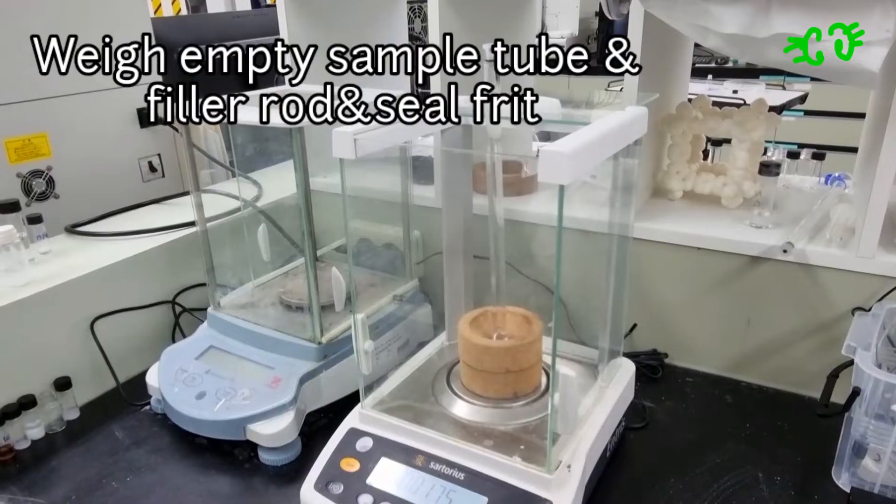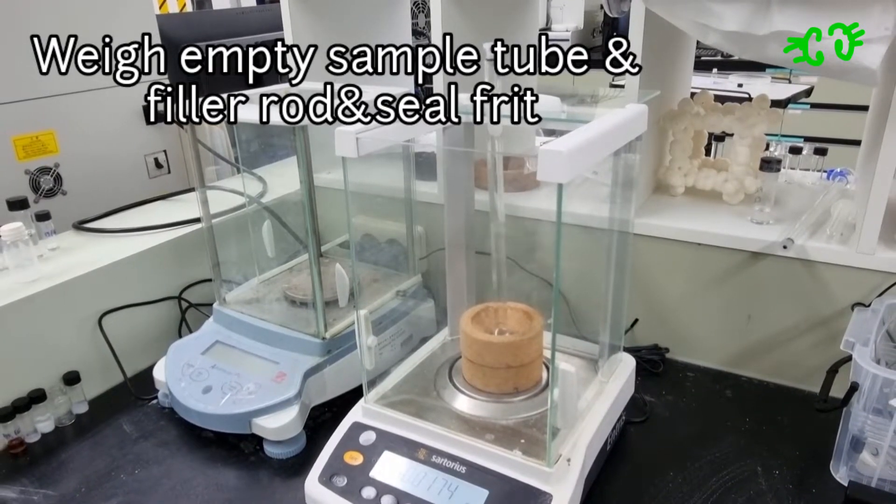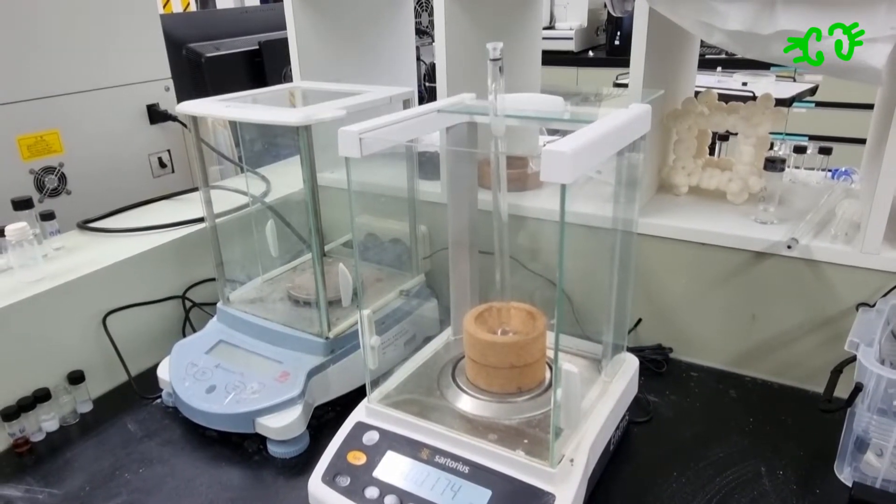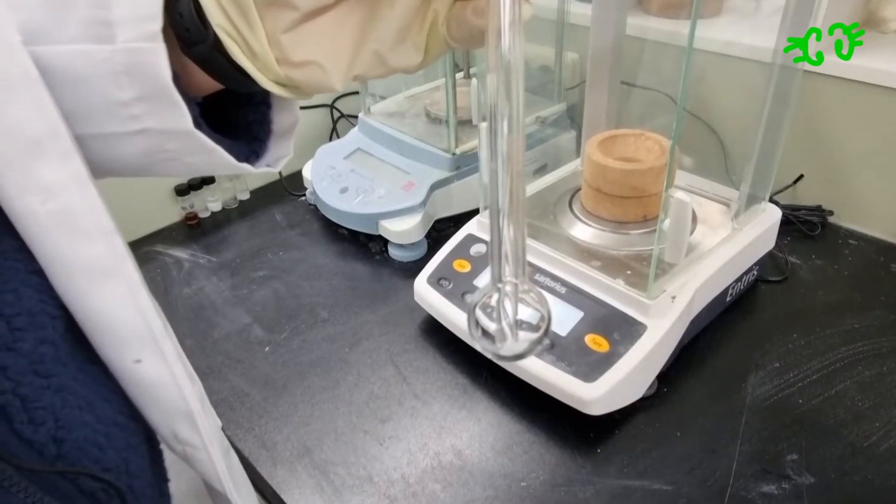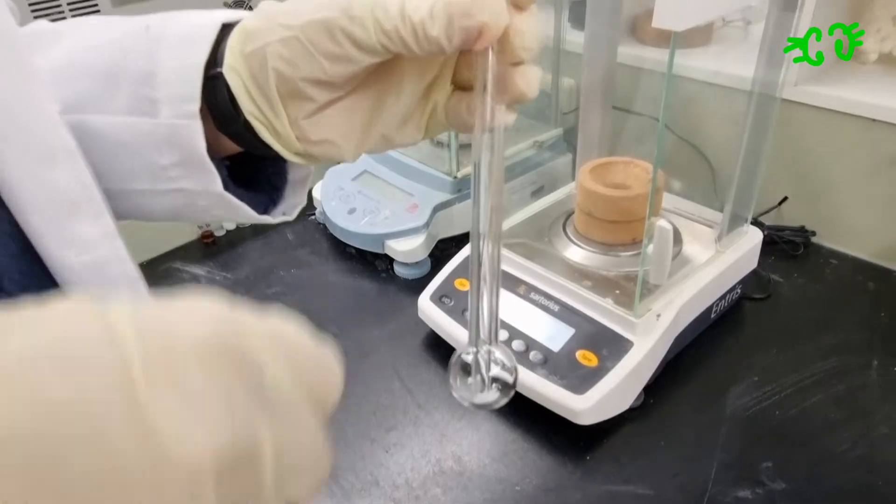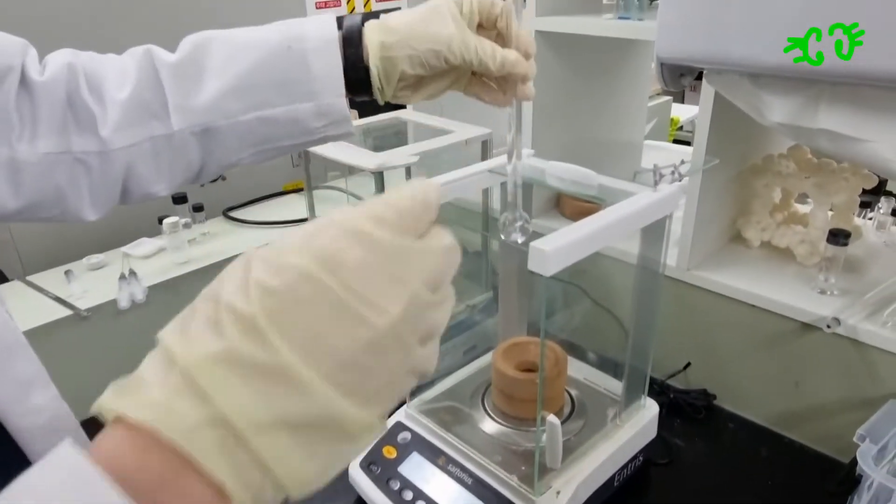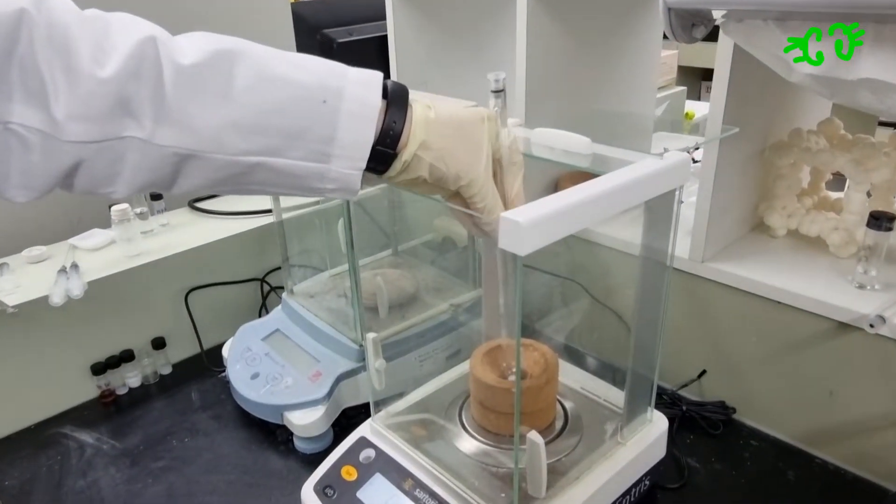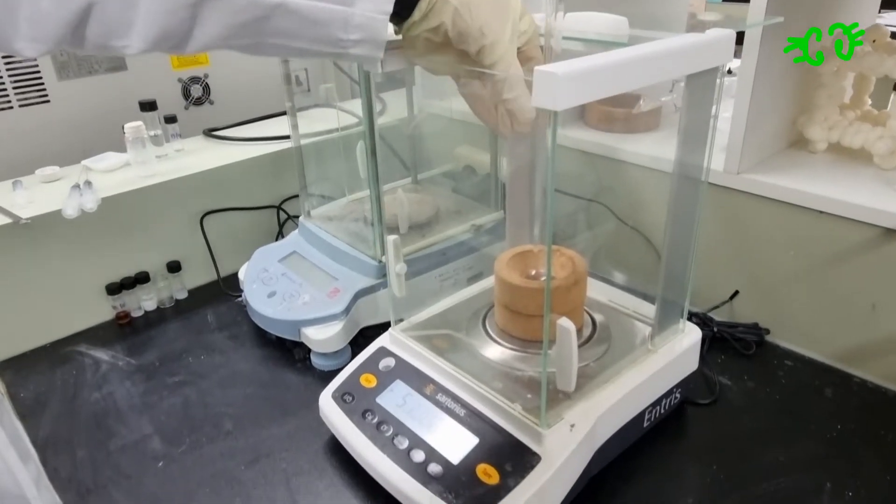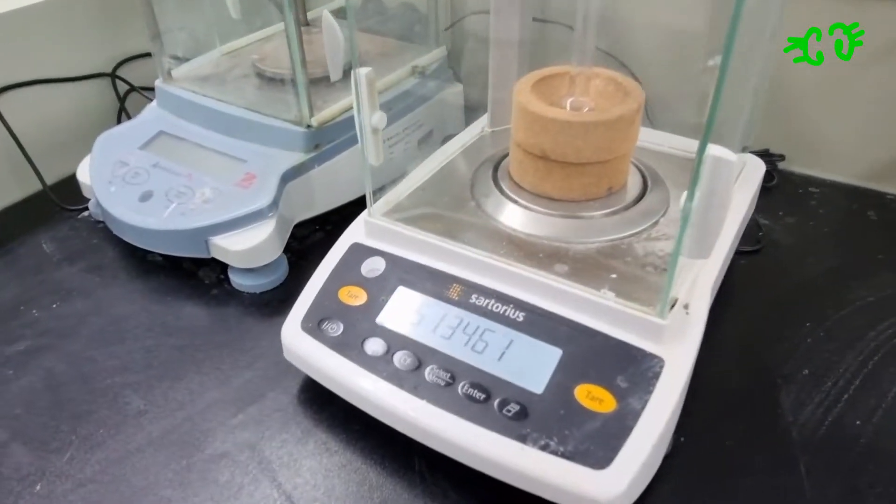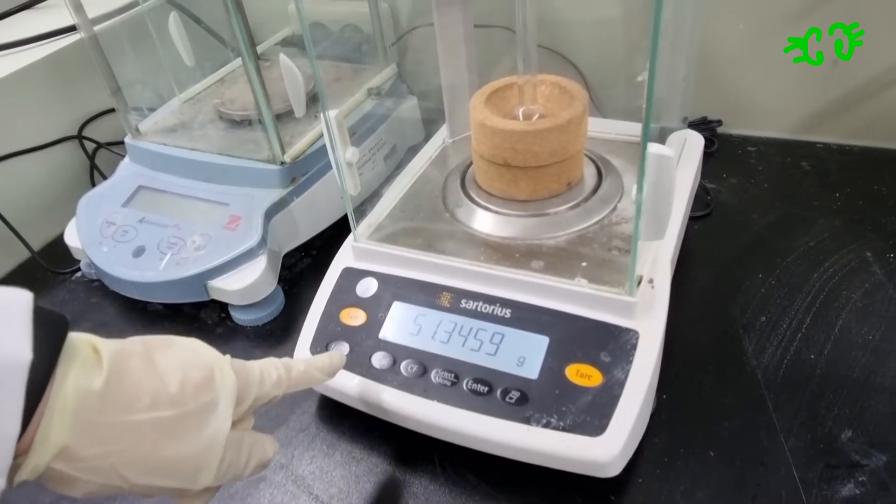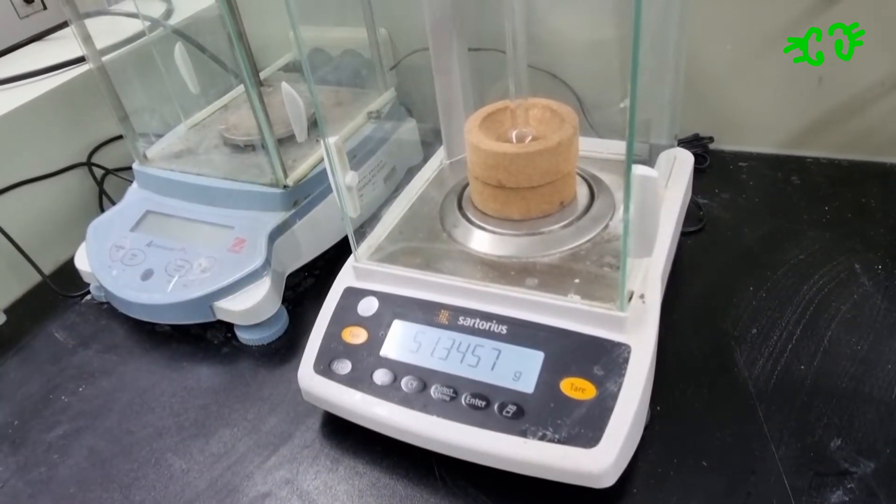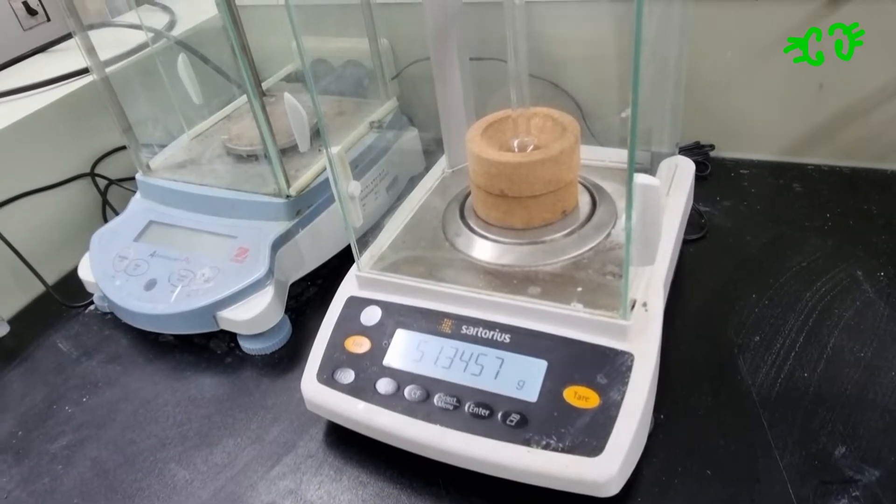First, we should weigh an empty sample tube with seal frit and filler rod in it. After adding sample into the sample tube, we should measure it again. We should subtract the empty sample tube mass from this and put it in the computer.